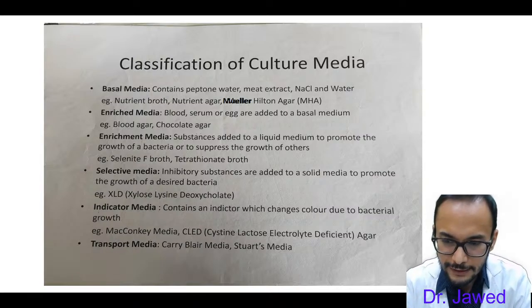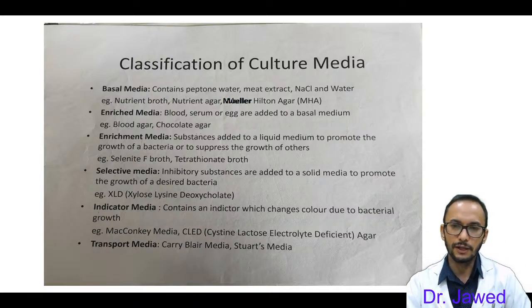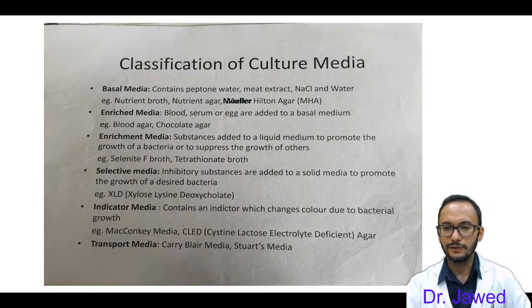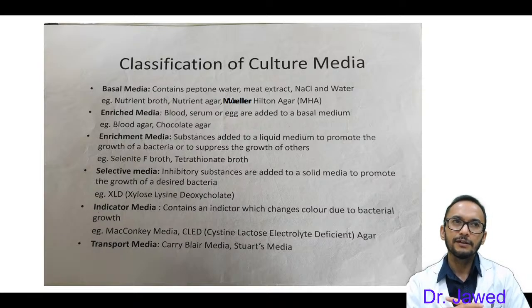So we are done with the staining and direct demonstration of organism by staining. Direct demonstration of organism is very important, and this is basically the first step in identifying an organism, and also preparing for the next step to put up the biochemicals. We have to know whether it's a gram positive or gram negative organism. The next step is biochemical, and we'll put up the biochemicals according to the gram stain.